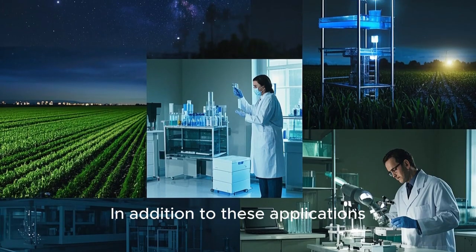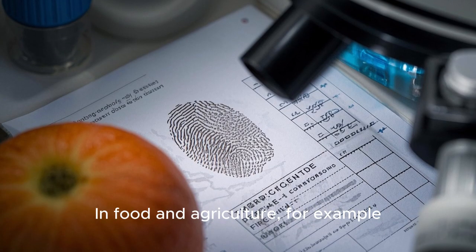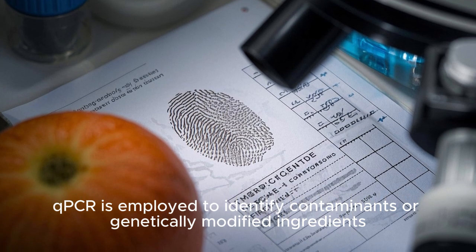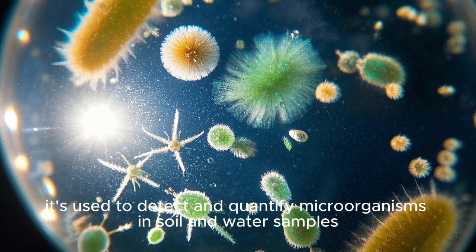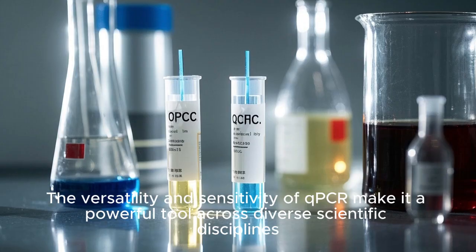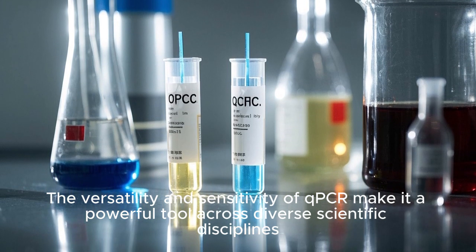In addition to these applications, qPCR has found uses in various other fields. In food and agriculture, for example, qPCR is employed to identify contaminants or genetically modified ingredients. In environmental science, it's used to detect and quantify microorganisms in soil and water samples. The versatility and sensitivity of qPCR make it a powerful tool across diverse scientific disciplines.